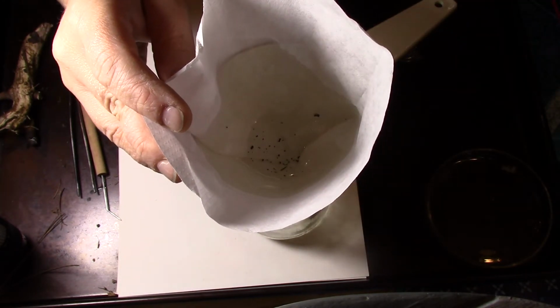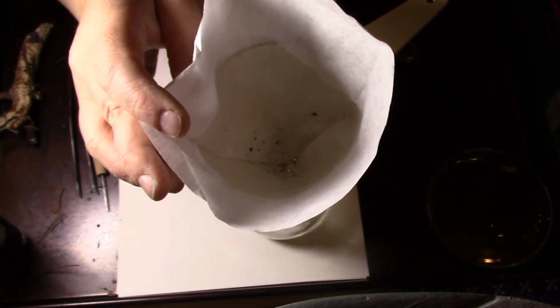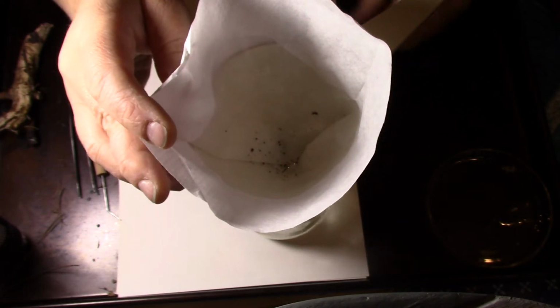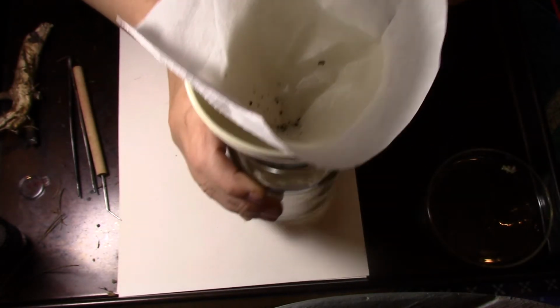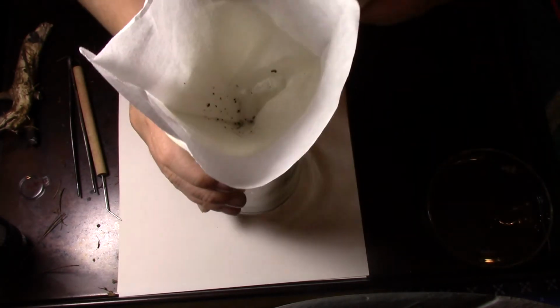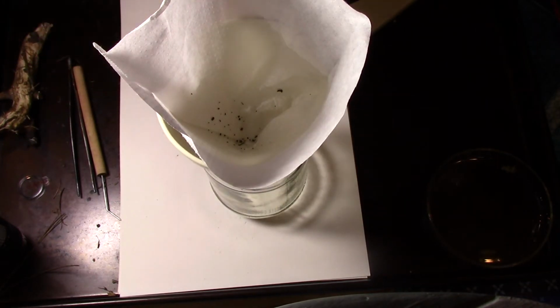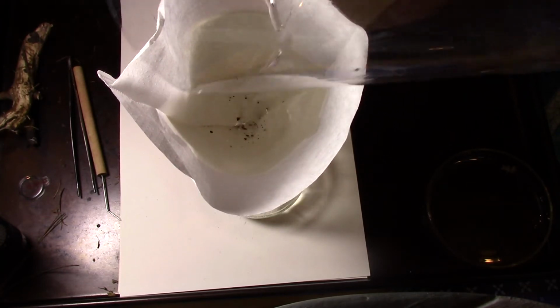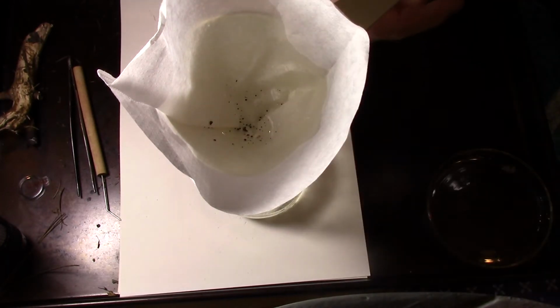Oh, that worked rather well. I have a few little bits in the bottom still, and I'm going to rinse and wash in a second, but first I'm going to let this drain. I just poured some of the liquid back into my Berlese-Tullgren funnel so I can wash it again because there's still some bits in the bottom. And I'm probably going to do that another time because there's still some more bits down there.